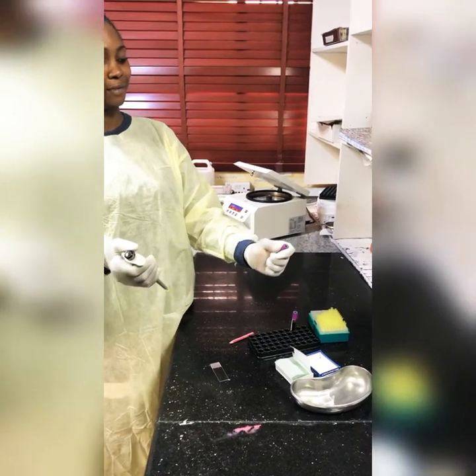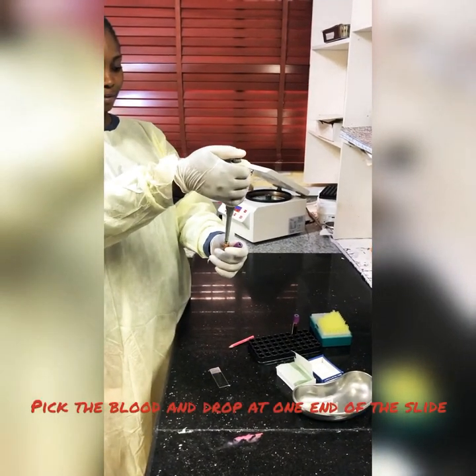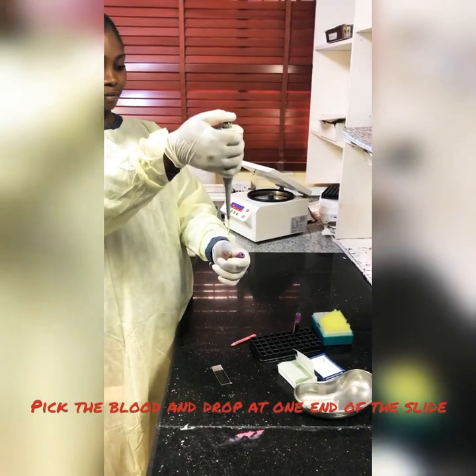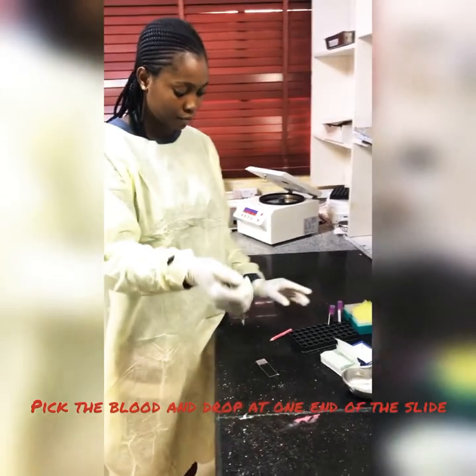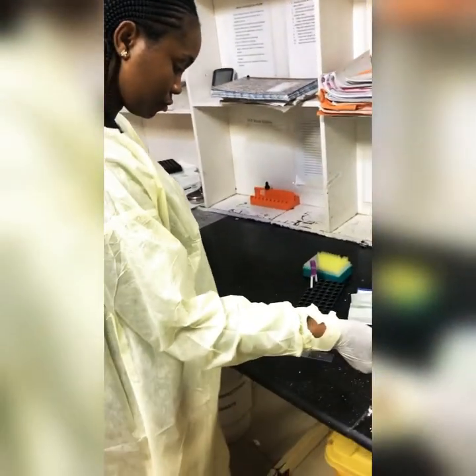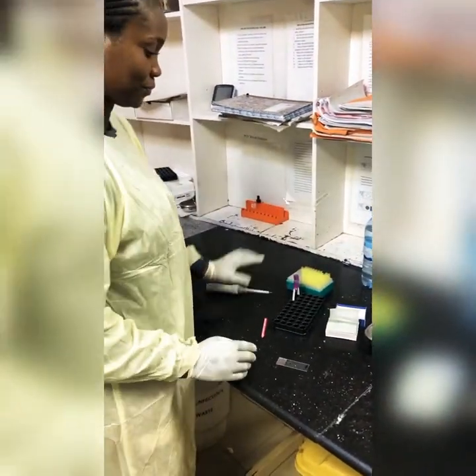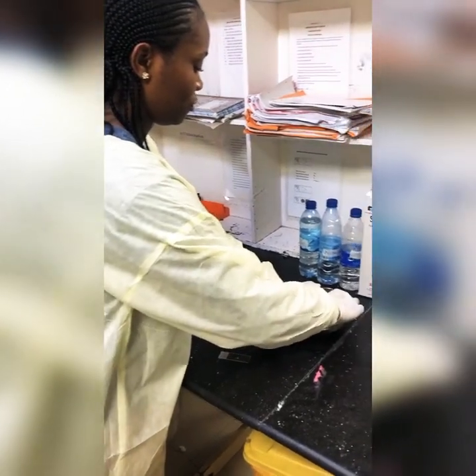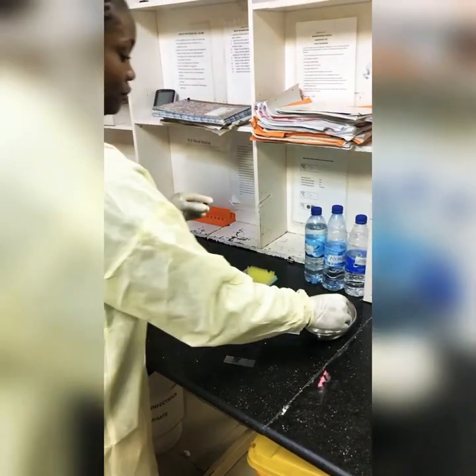Then pick the blood sample — two microliters of blood — and place it at one end of the slide. Discard the pipette tip. We have to make everything clean and slow — discard the pipette tip.